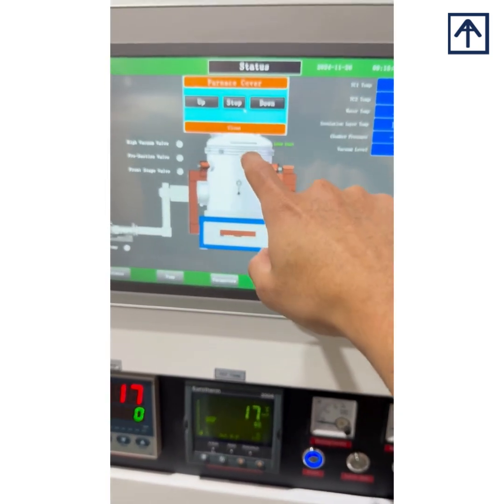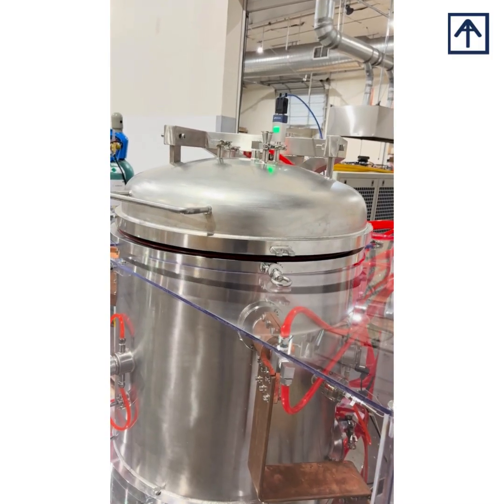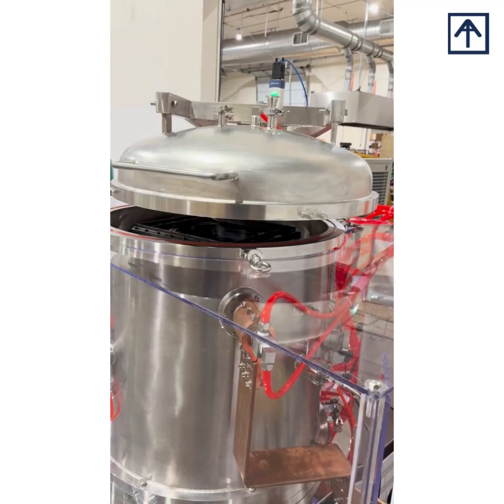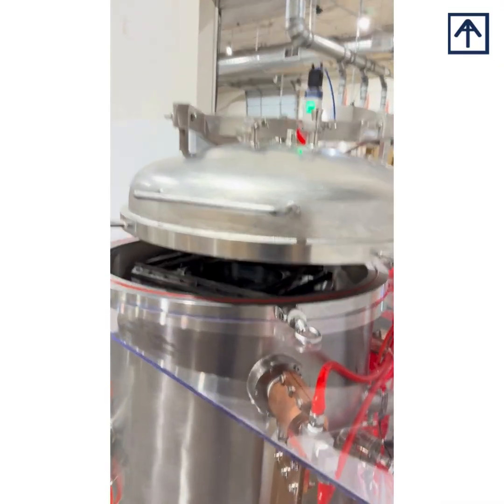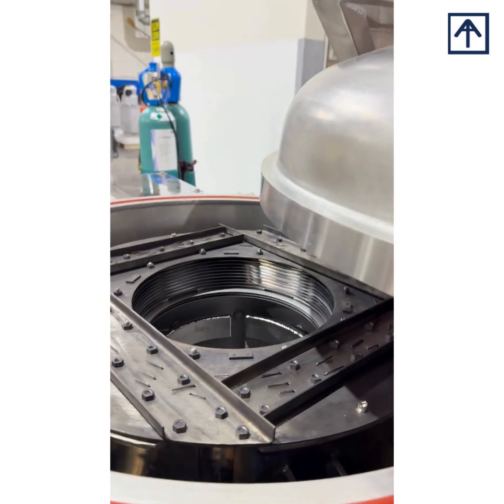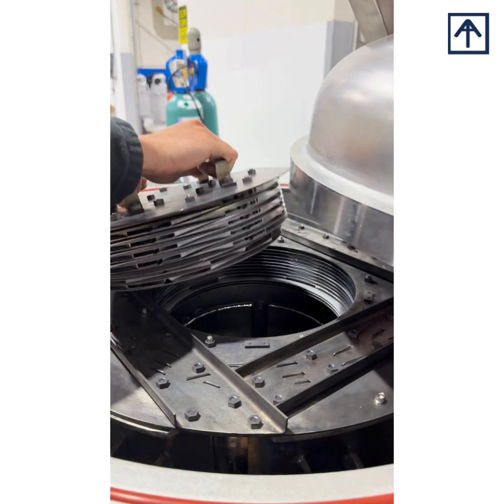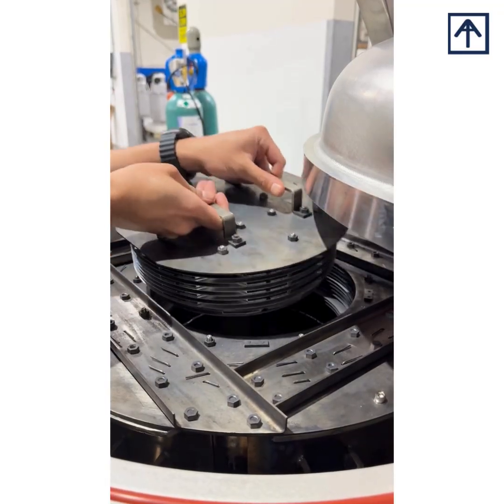So you can click on the furnace cover and then raise the cover by using the up arrow button. And that will stop at a specific point as soon as the limit switches are engaged. You can swing open the door. The unit comes with a lid on top of it as well, which you can put inside the chamber.